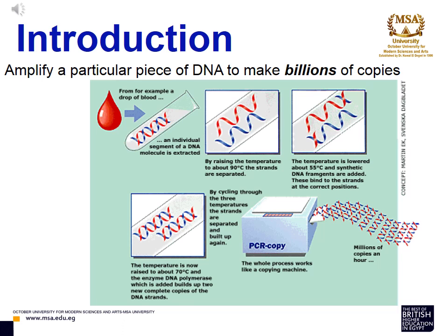PCR is a means to amplify a particular piece of DNA by making numerous copies of a segment of DNA. PCR can make billions of copies of a targeted sequence of DNA in just a few hours.